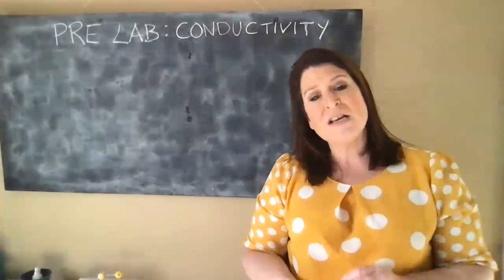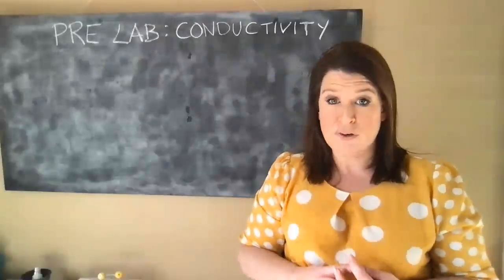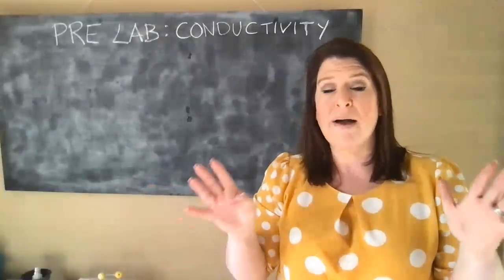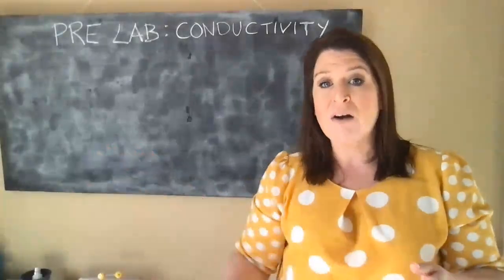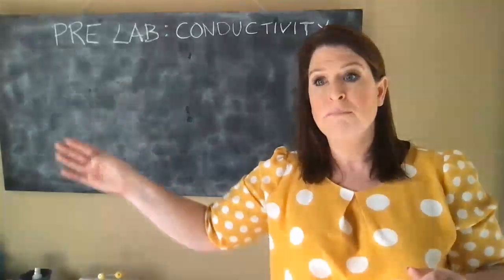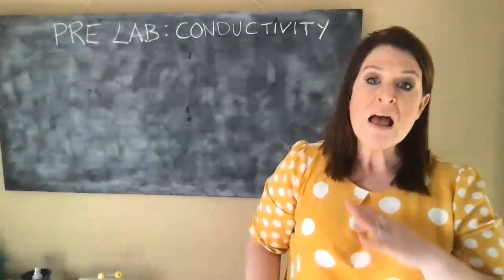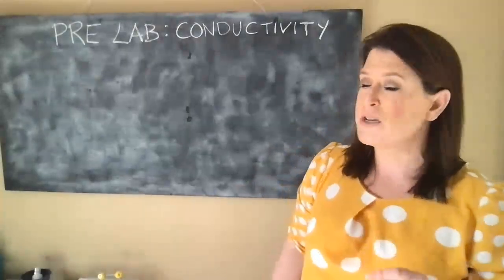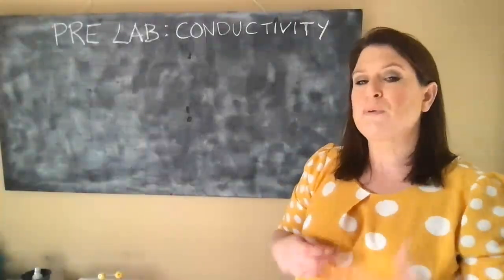The ability of a solution to conduct electricity is governed first and foremost by ions present in solution. The ions in solution actually carry the electricity from one part of the solution to another part, and we'll be looking at that in a little second in terms of looking at the probe and how we measure it, but the principles are the same.